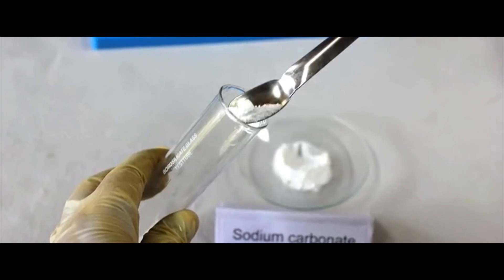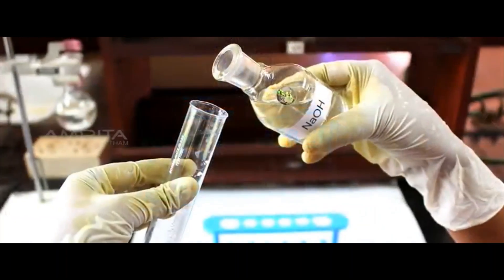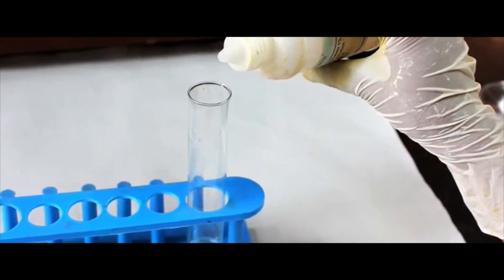Now add a small amount of sodium carbonate in a boiling tube and add NaOH solution into it. Then shake the boiling tube well. Add a few drops of phenolphthalein into it.